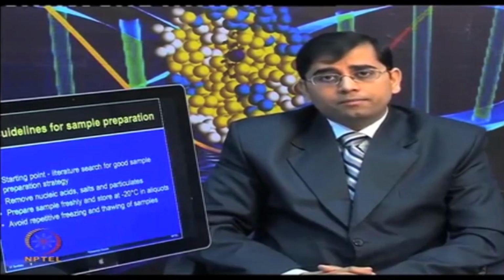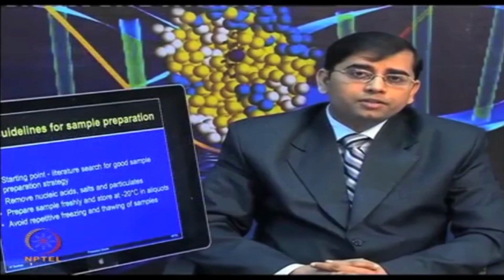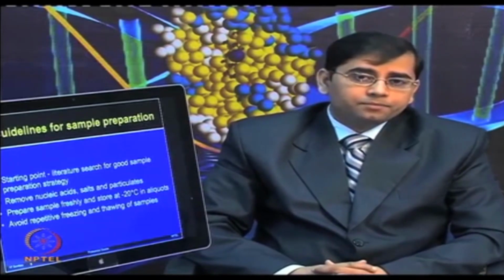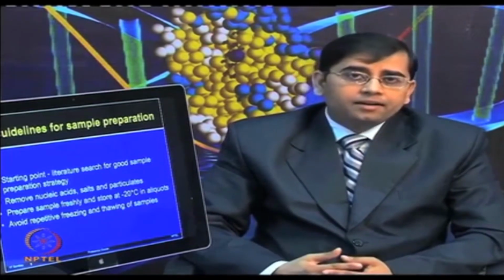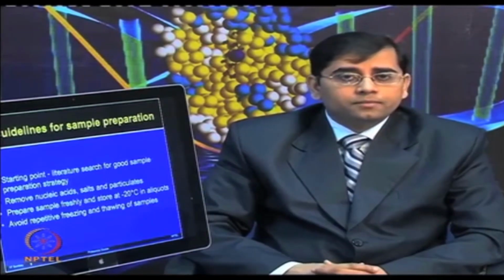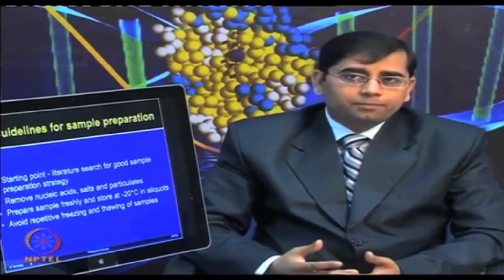As a starting point, one should start by finding a good reference from the literature, and then try to modify the protocol depending upon the objective of that experiment. You need to ensure that you remove nucleic acids, salts and different particulates. Prepare the samples as freshly as possible and store them at -20° in small aliquots. You should avoid repetitive freezing and thawing steps of the sample.